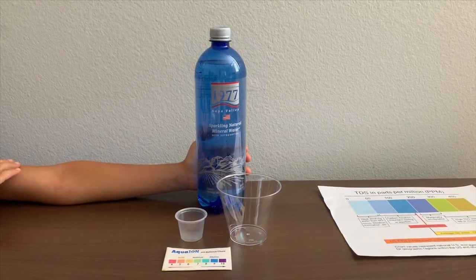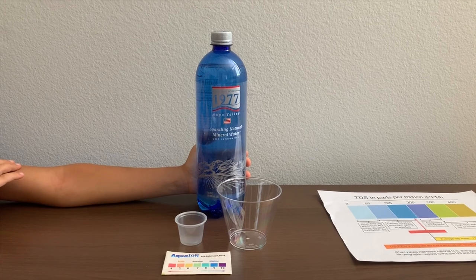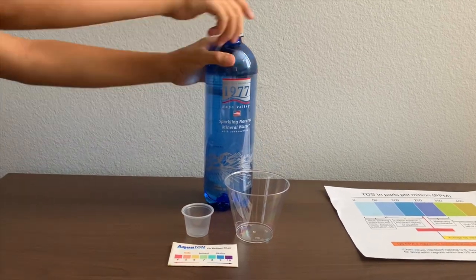This is Crystal Gazer 1977 Napa Valley Sparkling Natural Mineral Water with carbonation. It's sourced from California. Let's test the pH and TDS levels.